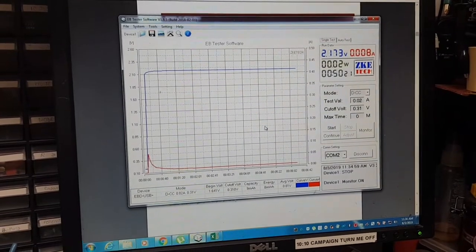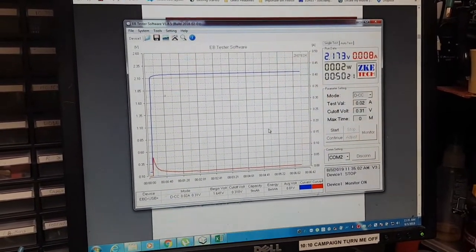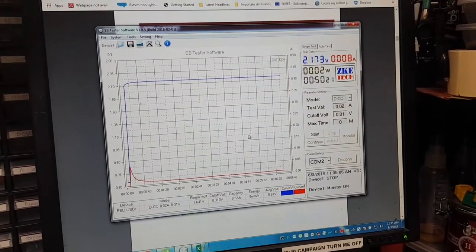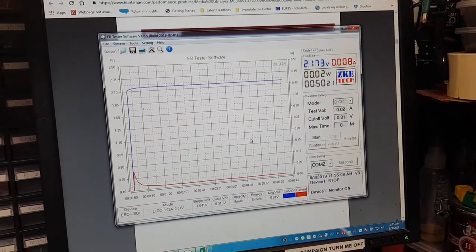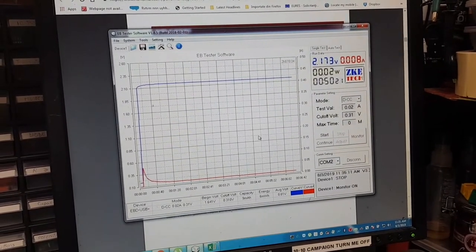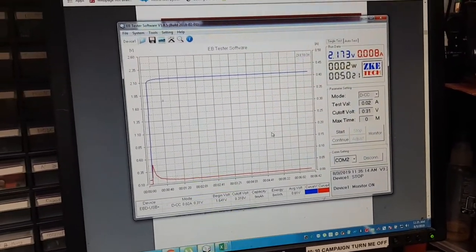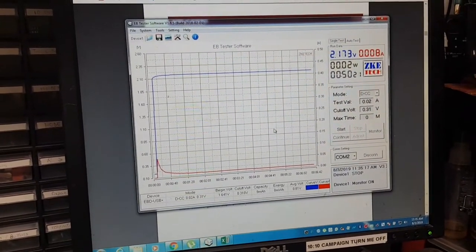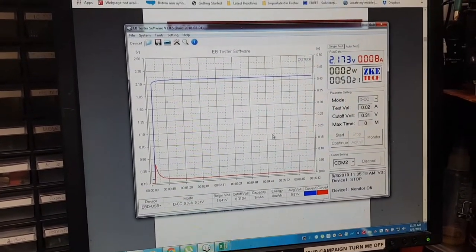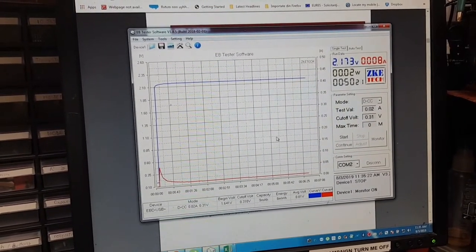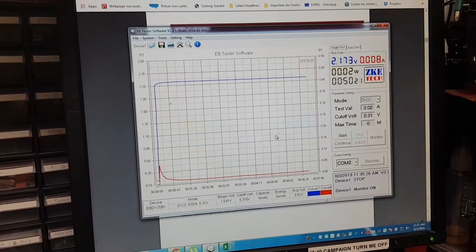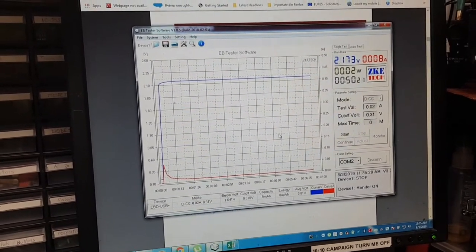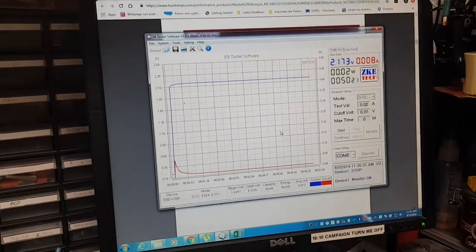I'm going to build a new cell for the zinc chloride based deep eutectic solvent. The ammonium chloride and urea device honestly doesn't look that great - it's only drawing 8 milliamps now. I'll leave it till we get to 10 minutes and then start discharging.